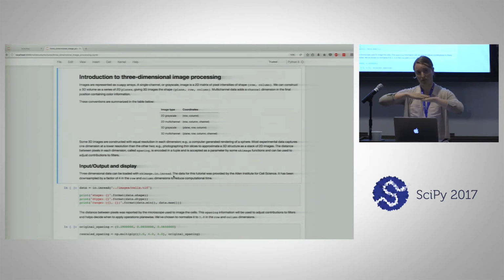There's quite a bit of a gap between the image planes. Folks who are working on tissue might thinly slice their tissues, and so they'll have a finer depth between their slices, but that scaling is still much larger than what the actual camera sees in those rows and column dimensions.